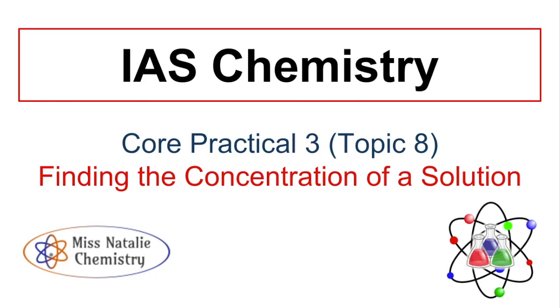Welcome to the second video in our series of core practicals. Today we're going to be looking at core practicals 3 and 4, which can be covered in the Unit 3 paper of AS Chemistry. Core practicals 3 and 4 are both very closely linked as they both involve a titration. However, core practical 4 is a slight difference as it requires you to also make a standard solution. But let's start with core practical 3.